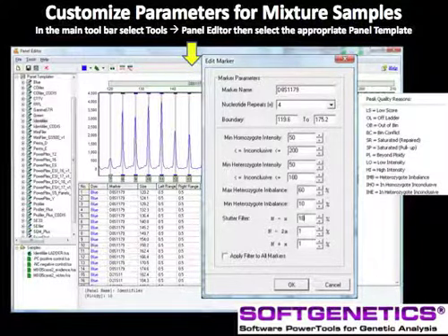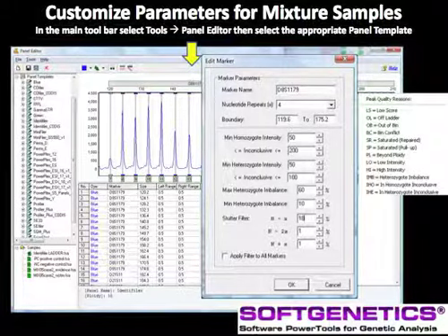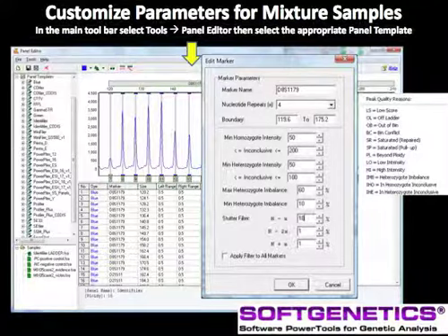An essential parameter for mixture analysis is the minimum heterozygous imbalance. Peaks below the minimum heterozygous imbalance are not called. In other words, the minimum heterozygote imbalance setting acts as a filter rather than a quality flagging parameter. A typical setting for single-source samples is a 20% filter. This will miss minor contributor peaks.